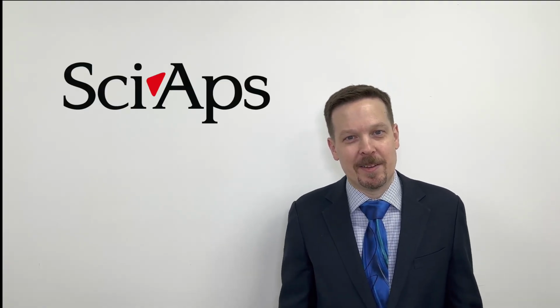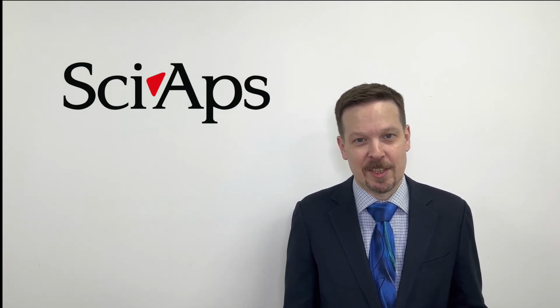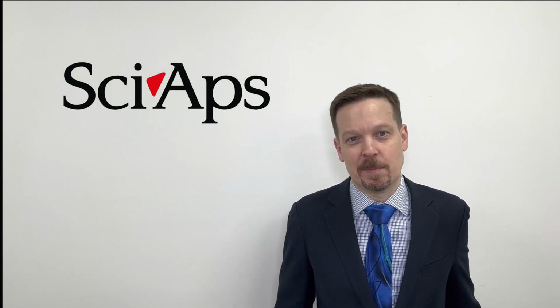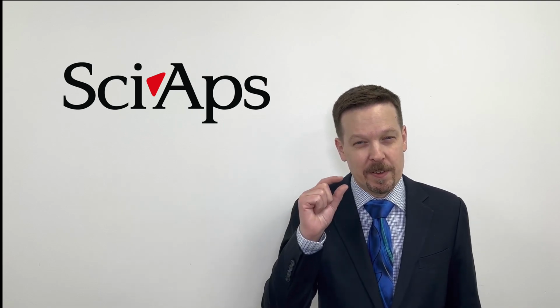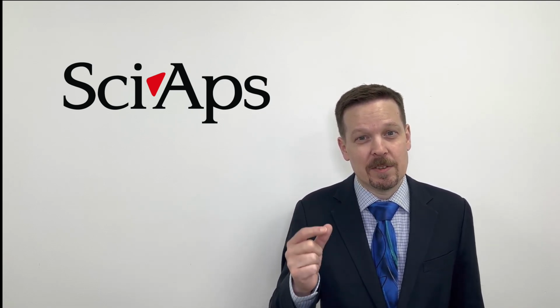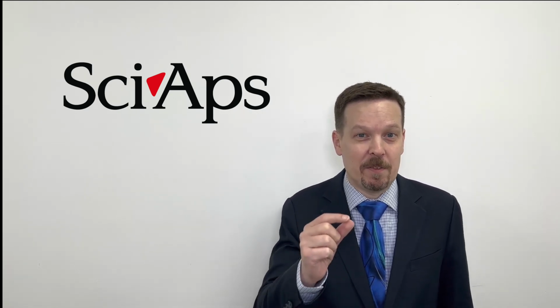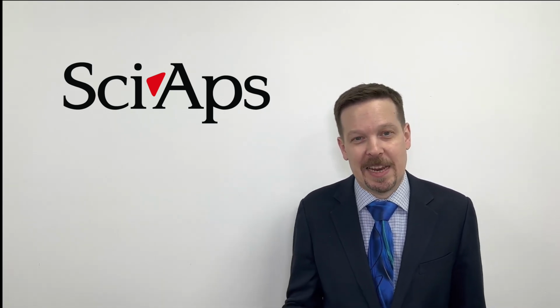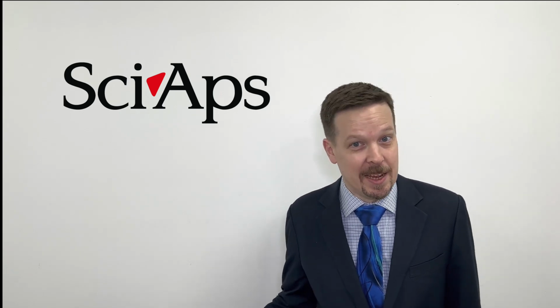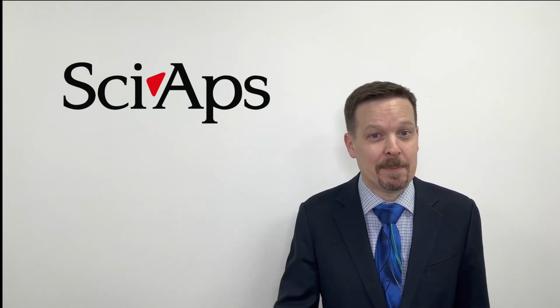Today we're going to talk about targeted microanalysis, or TMA. And SciAps offers the only instrument that's able to do this type of analysis. It's a screening method that allows you to focus on a very small surface area. Generally, our LIBS instrument can focus on a spot size about 50 microns wide and about 10 microns deep. So this is the type of analysis that you need a scanning electron microscope or an ICP to do. But now you can do it with a simple screening tool like SciAps LIBS.